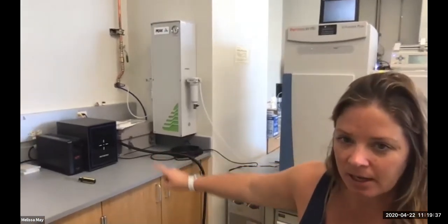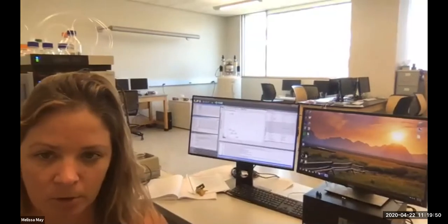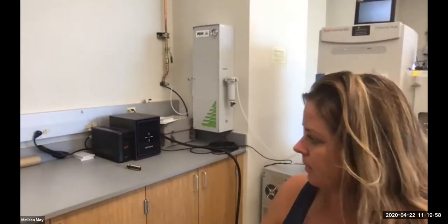This little setup we have right here is our backup storage. So all of the data that is collected onto our computer, the cube computer that operates the instrument, is stored on this NAS, and then we can access it remotely. So it's backup for all of the data.